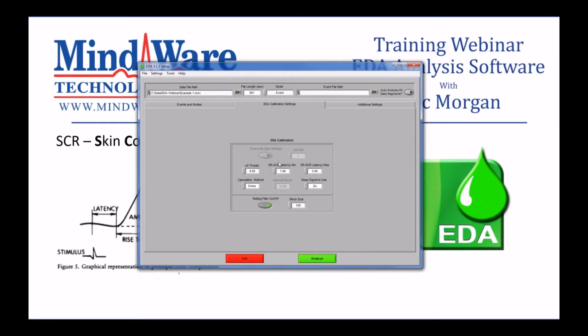ER SCR stands for event-related SCR. And we want to consider an SCR event-related if it starts within a certain latency following a stimulus. And by default, typically, these will occur between 1 and 3 seconds post-stimulus. So those are the default values here. But again, not everyone's in agreement about the time that it's appropriate to consider something event-related. So they are programmable, and you can change them to whatever you'd like. These are in seconds.